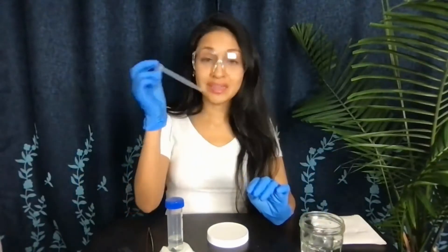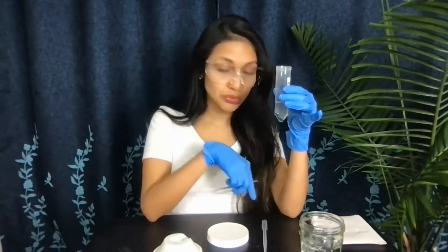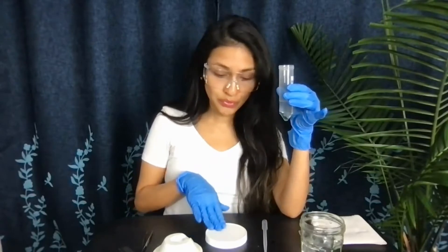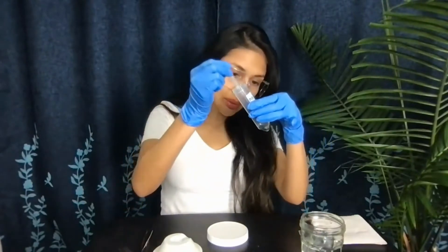I have a clean plastic pipette which I will use to transfer. I'm going to use a few different things: a razor — just be very careful with it — and tweezers in case I need them. I'm using this lid right now just because it's very resistant as a cutting surface.